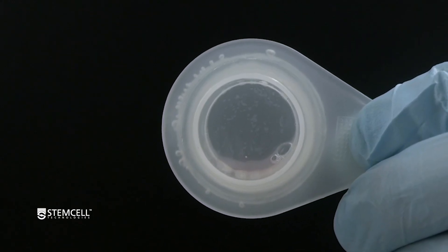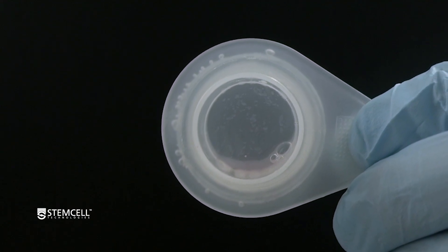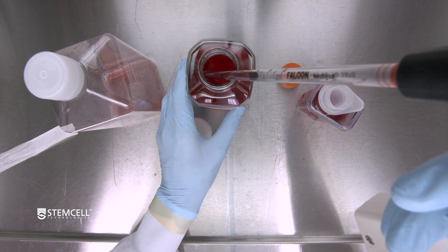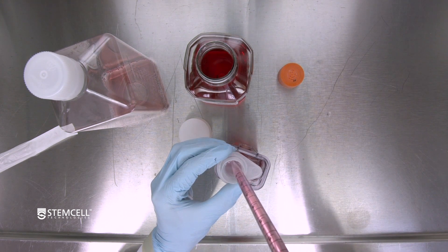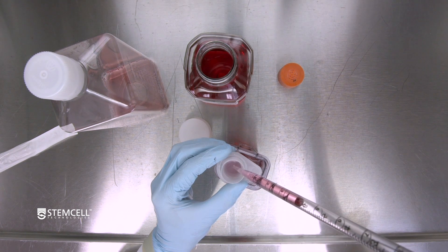Inspect the bottom of the filter for any aggregates. If there are some aggregates sticking to the filter, aspirate the remaining 10ml of fresh media and place the pipette flush with the filter and pass through. If there are no aggregates stuck to the filter, the pipette does not need to be flush with the filter.